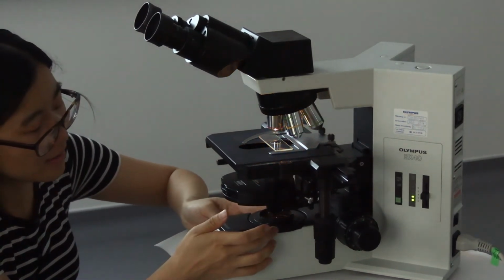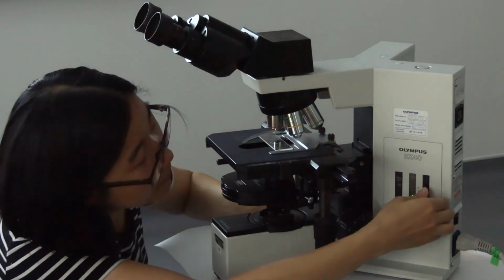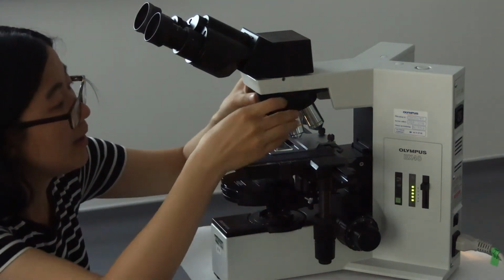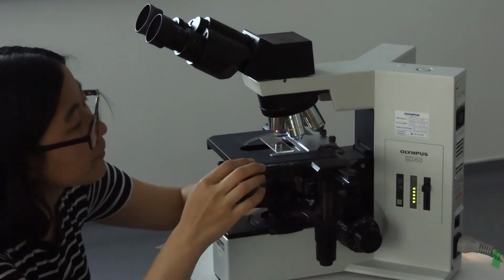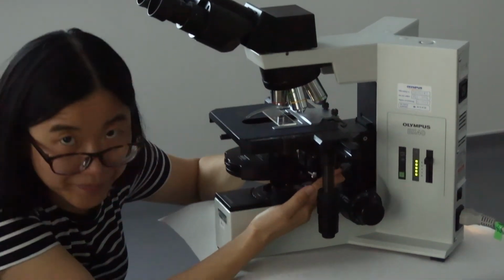Then turn it counterclockwise to the minimum size, and use the 4 times objectives. And there's a small screw here that you can move the condenser up and down. So let's try to move up.